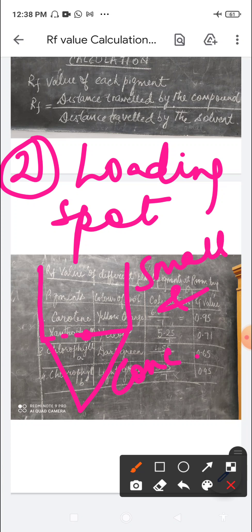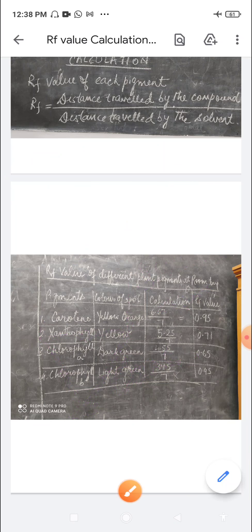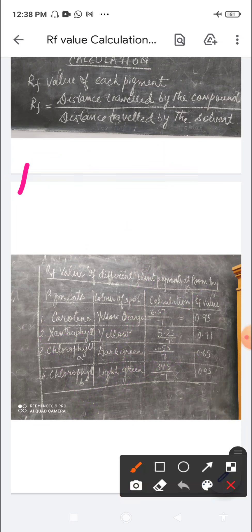The third precaution: the loading spot should be placed at least two to three centimeters away from the tip of the notch. The loading spot should be two to three centimeters away from the tip.